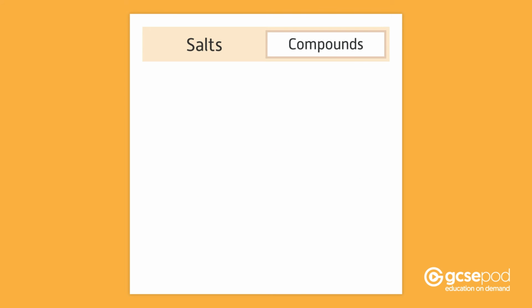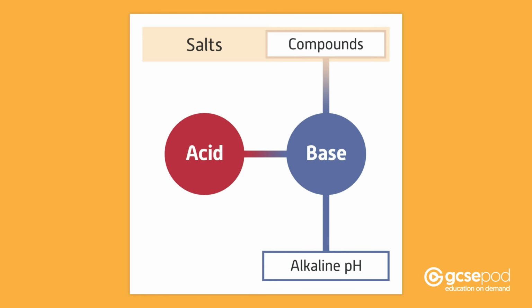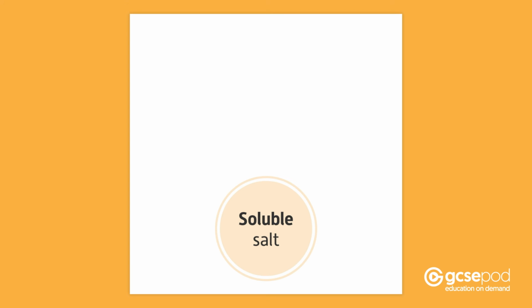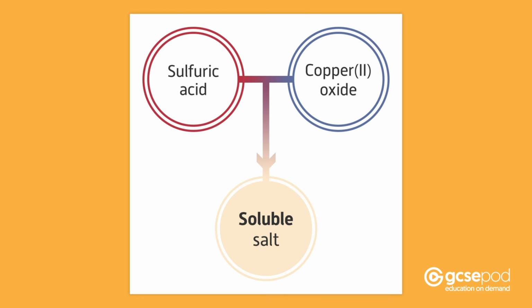Salts are compounds made when an acid reacts with a base. Bases have an alkaline pH, and examples include metal hydroxides, metal carbonates, and metal oxides. In this pod, we shall look at the method used to make a soluble salt by reacting an acid with an insoluble base. The reactants we will use are sulfuric acid and copper-2 oxide. The salt made will be copper-2 sulfate.